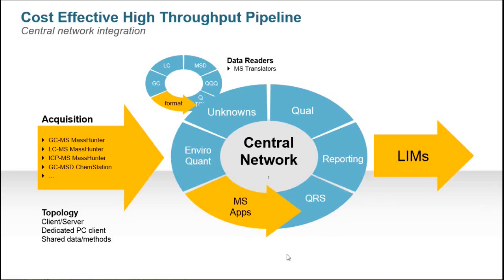Okay, so the solution that I showed you with the NAS solution, where the data is copied over the network, with XP and network card, you could implement that, because really what needs to happen is the data needs to be copied. Once you're finished with acquisition that way, that would work on an XP system, or Windows 2000 system, because that's really all that's needed. The acquisition subsystem is running basically as a standalone system.